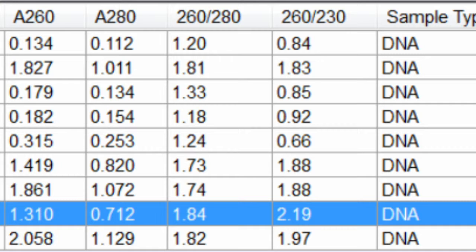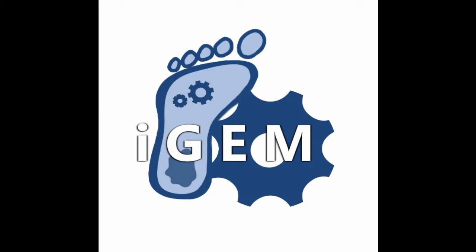Pure RNA will have a 260-280 value of around 2.0, and a 260-230 value ranging from 1.8 to 2.2. Now that you understand how to use a nanodrop to measure nucleic acid concentration and assess purity, you are one step further to mastering the laboratory. Go forth and discover!